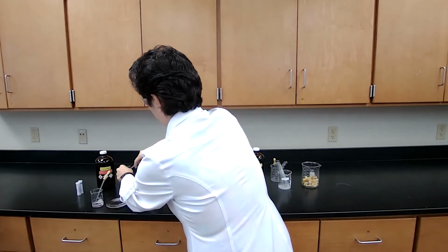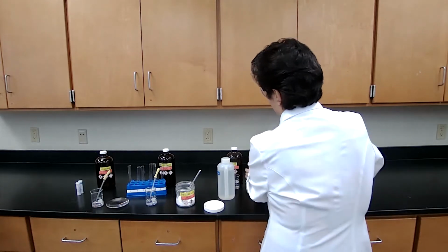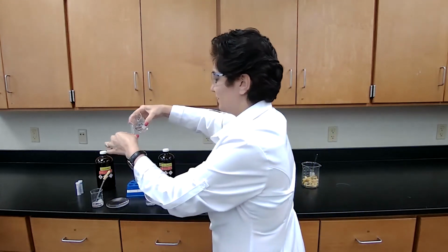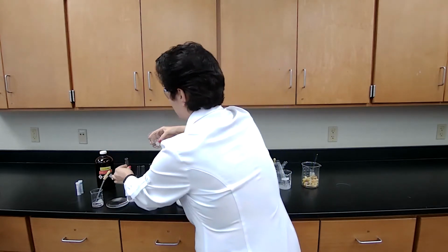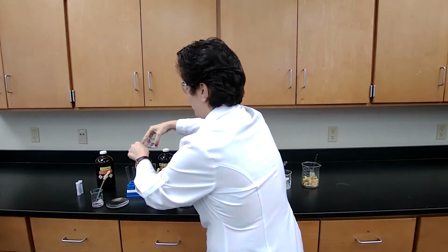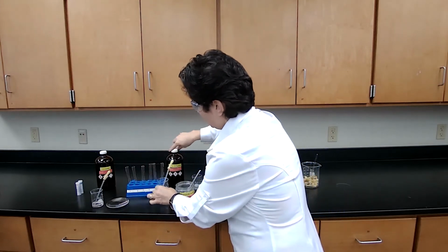My next solvent is the sodium hydroxide. So in 6 molar sodium hydroxide, I'm using 6 molar sodium hydroxide. Based on the procedure, I would place about 1 inch of the solution in each of the 3 test tubes, and check the solubility for my organic compounds.